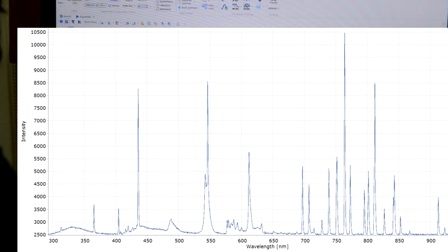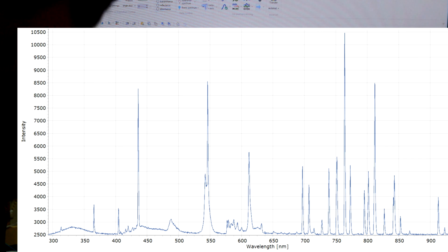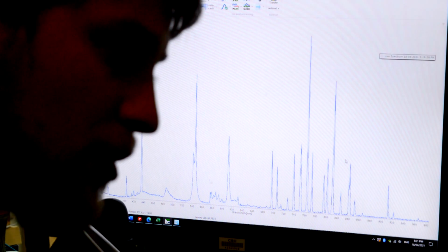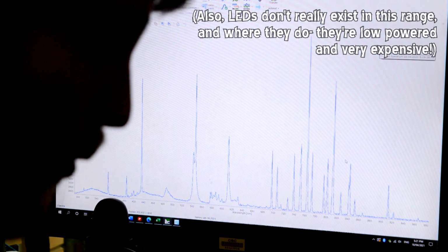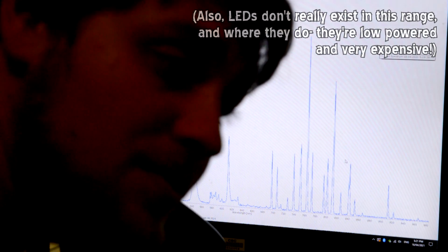It's not a whole lot of light, percentage-wise, that is coming out in that region, but I'm hoping it might be enough. The advantage of using a lamp like this that's reasonably low wattage is that it won't put out a whole lot of heat. If we use something like a sun lamp, it puts out a whole lot of infrared as well, so much heat that we'll need to actively cool the reaction, which will be hard to do because I'm not very good at engineering something like that, and we're running it in DCM, so we don't want to boil our reaction mix. This lamp is what I'm thinking to use for the UV step.